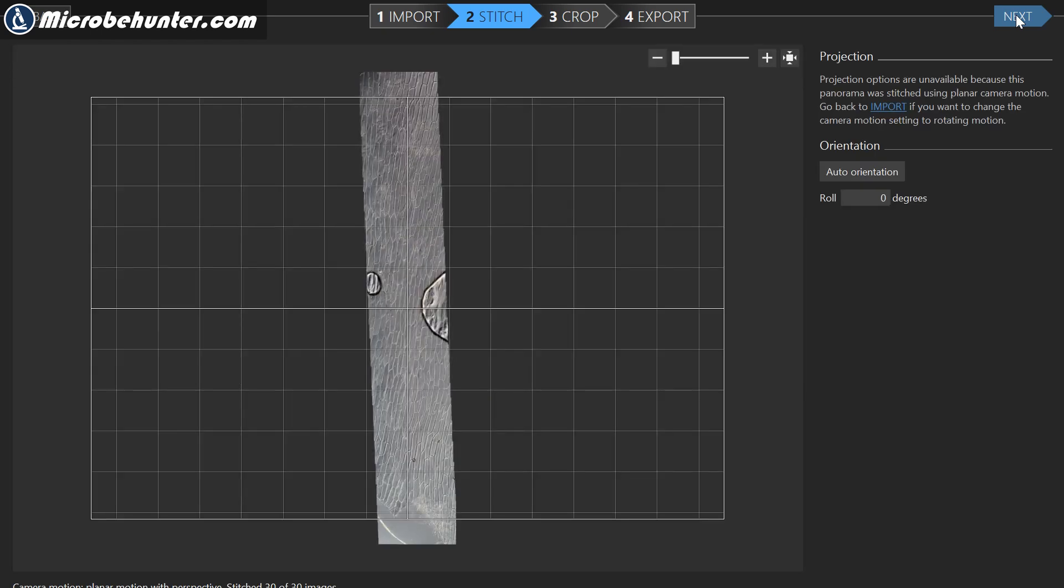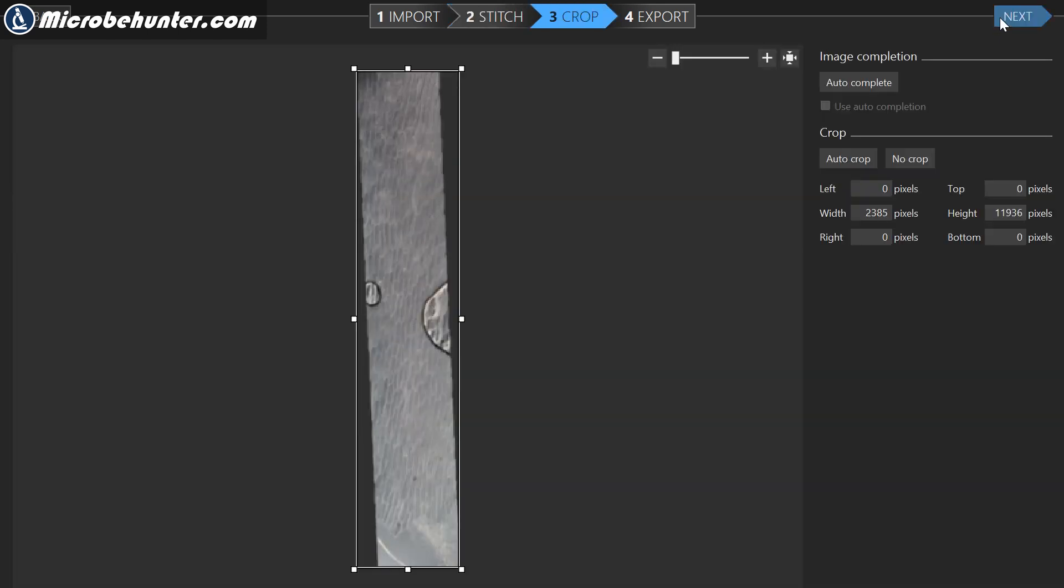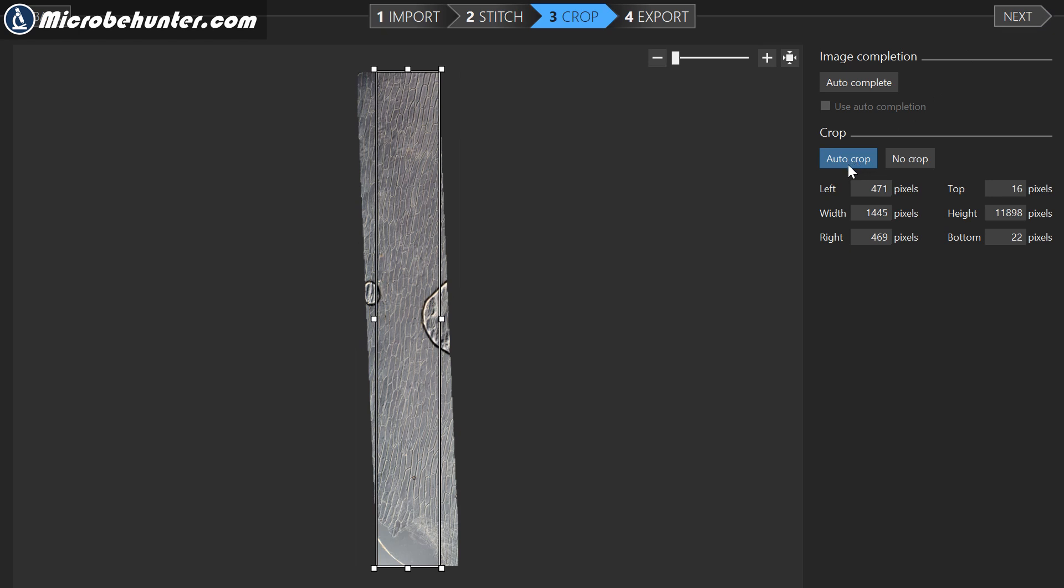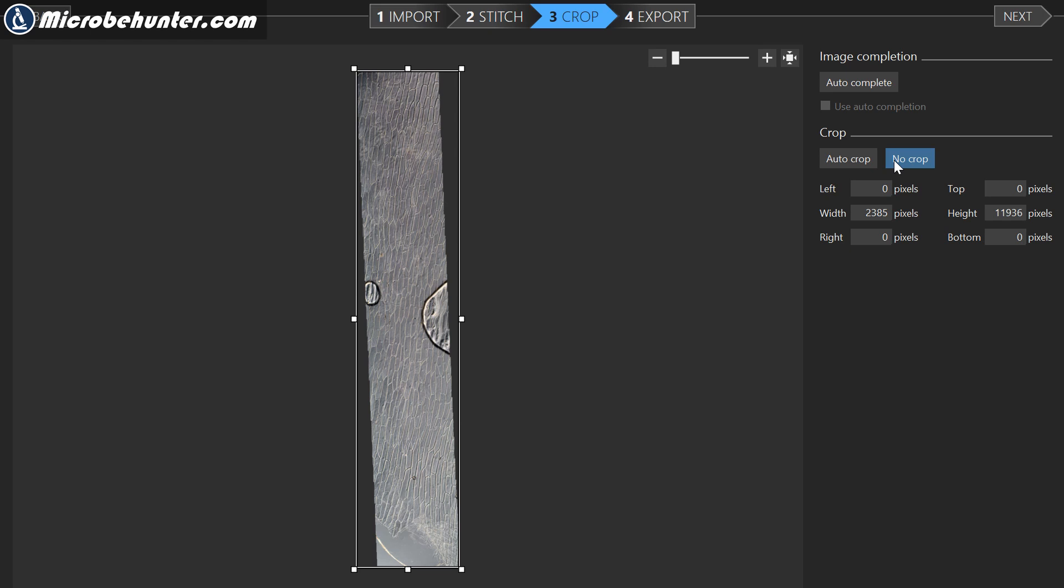You see that because I was only moving the stage into one axis, I'm getting a very long image. Because the camera was not perfectly aligned, it's a little bit skewed. This does not matter. I'm not going to crop it. I'm simply going to add a panning that follows the direction of the image later on.